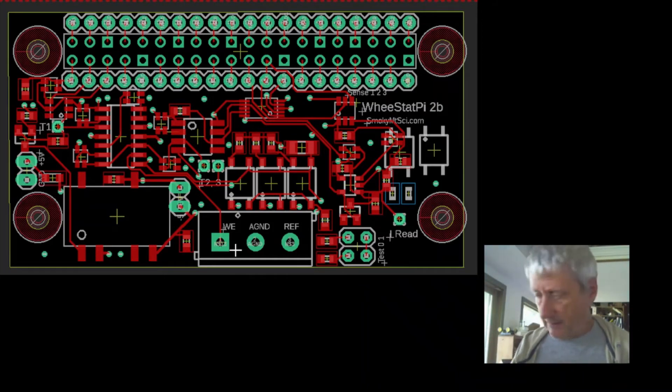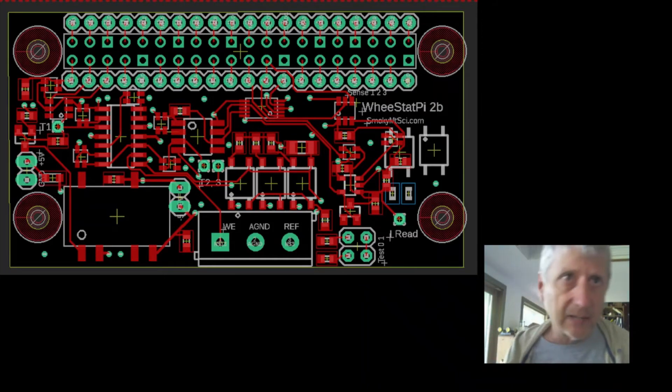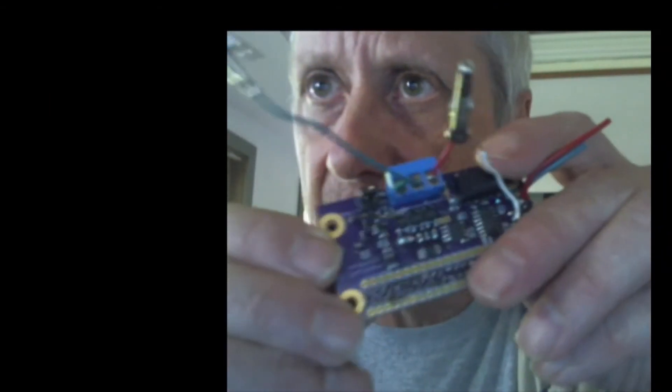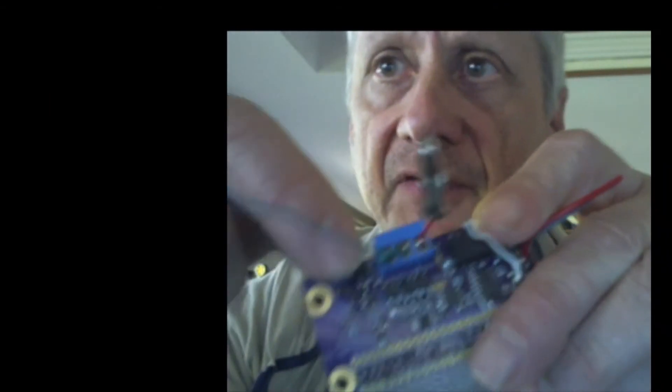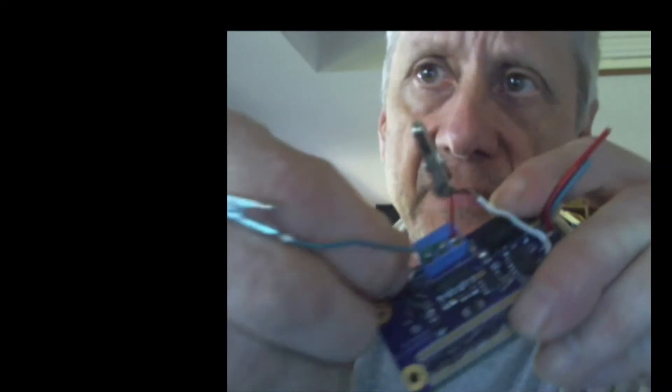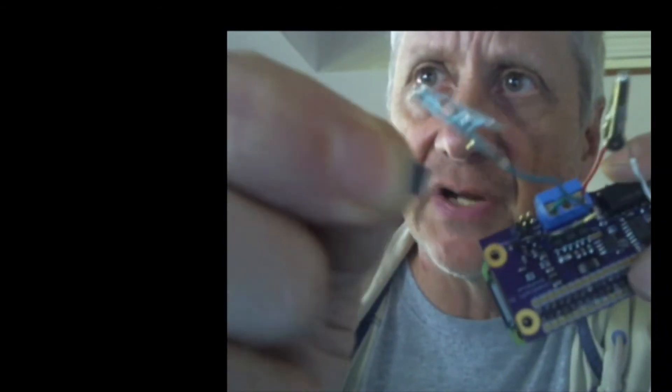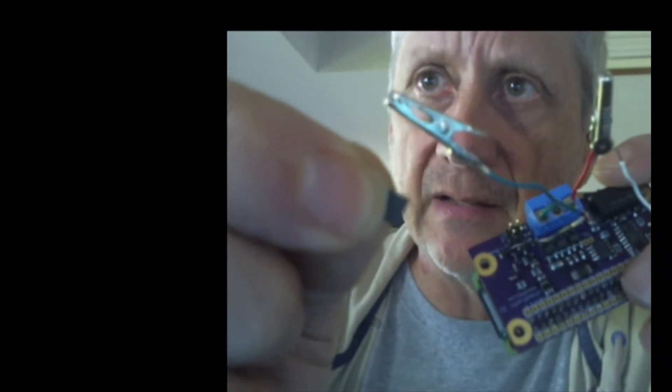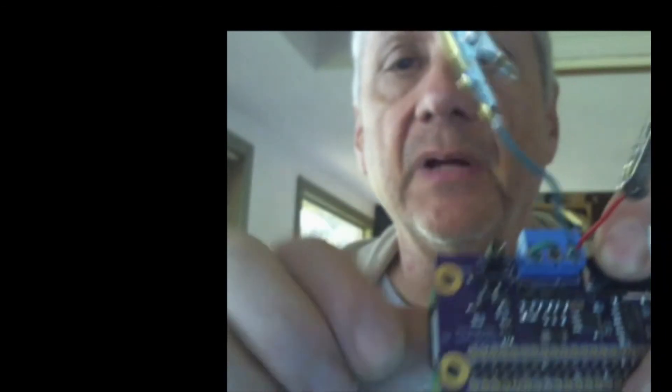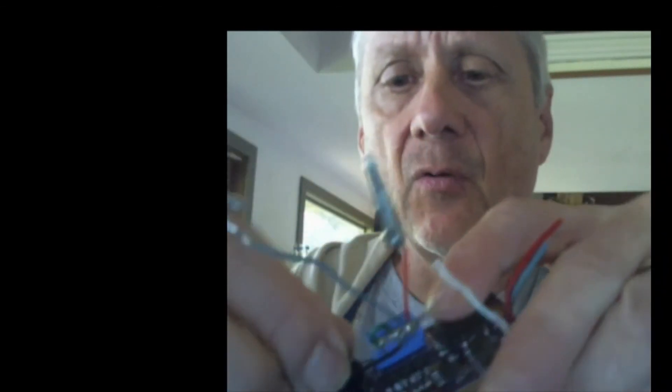All right, so let's go back to that one, and I will try to point out, this is the test resistor, removing the jumper. There's the jumper, and putting it in the vertical position like that would be set up for running. In the horizontal position is for testing. And we have two different settings for different testing conditions, different orders of magnitude of the resistance.